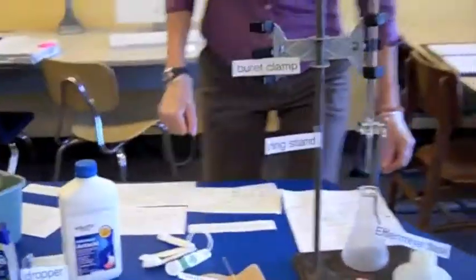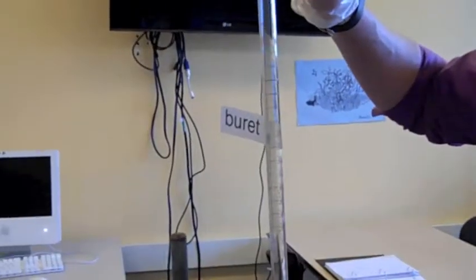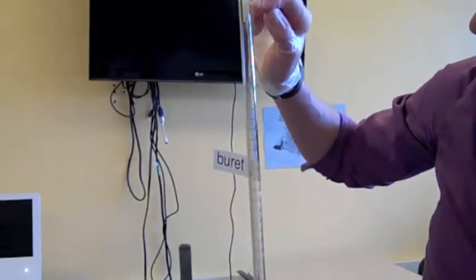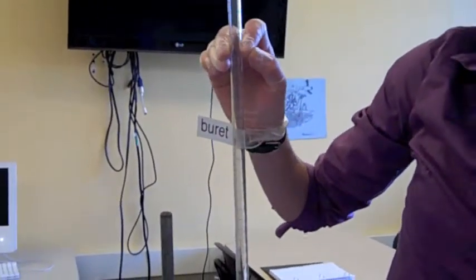Okay, the last step is going to be subtract the volume that you started with. This is confusing because this says 0, but what it's really measuring is 50. If it says 0 and you filled it up to here, that means you've got 50 milliliters. So say you started here and you ended where it says 7, you've used 7 milliliters of acid. And you're going to do this 2 more times, so each time the numbers are going to be different.